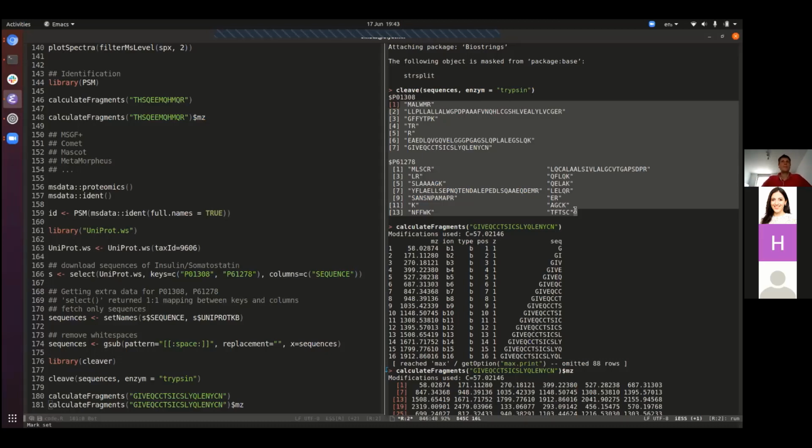Okay, so this essentially becomes a probabilistic mapping problem, which is probably computationally very expensive. Yes, it is computationally expensive, although some of the more recent software are extremely fast, so that's not too much of an issue. The problem is not really computational, it's more statistical.